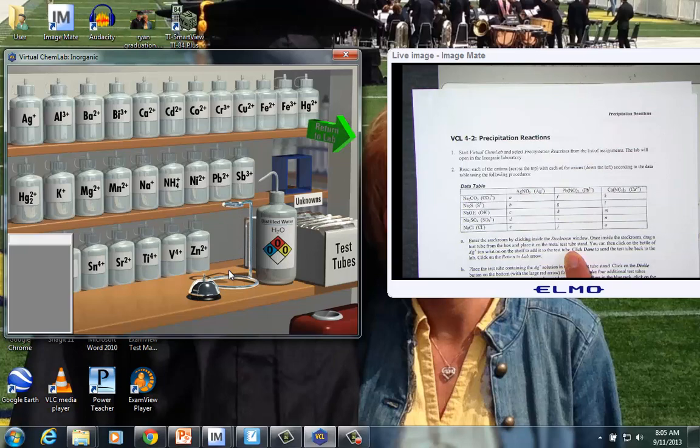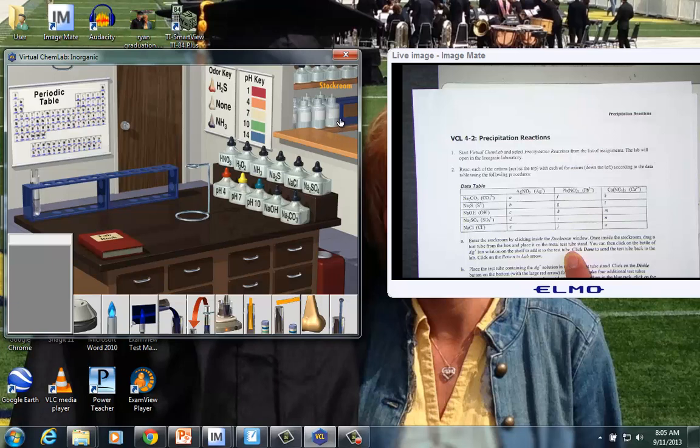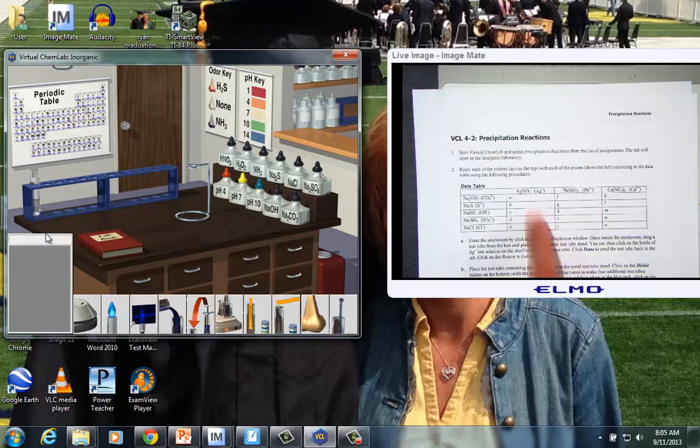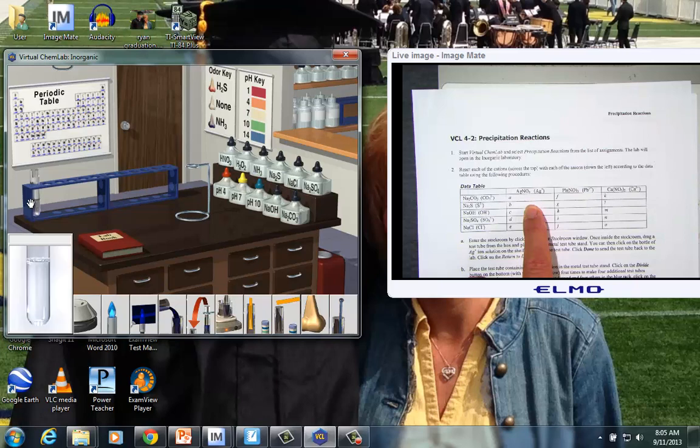And we'll click done. What that will do is bring it out to the lab for us. So notice the test tube disappeared, and here we are at the lab. So I just click to go back there. And here it is sitting in the stand for the test tubes.